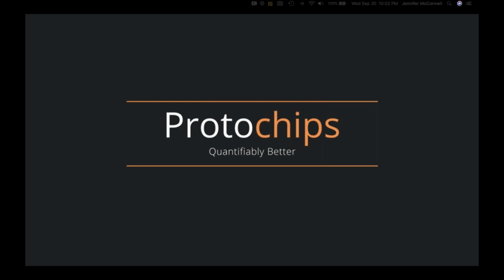Our previous webinars have covered many applications that demonstrate these capabilities. So if you have an opportunity to take a look at some of those on our YouTube channel, please do so. There's a lot of great information there. Although we designed AXON for in situ applications, these capabilities are applicable well beyond just these techniques.